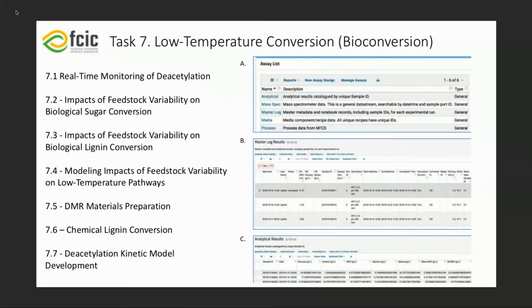But what's different about our endeavor is that we have this whole research component where we're making up experiments to study the system, and we need to integrate all that. And that's where LabKey really is so well placed. And also the fact that LabKey is based on a broader scientific method instead of just hard-coded for a specific use case has really allowed us to take it and apply it in this very different domain. And there's going to be multiple examples that I think we'll see over the years.